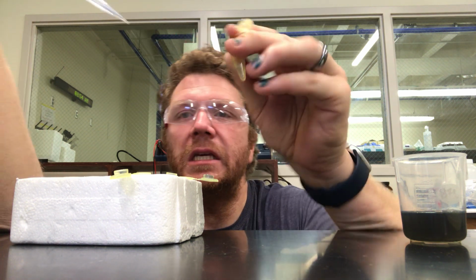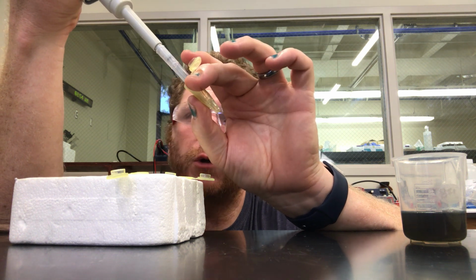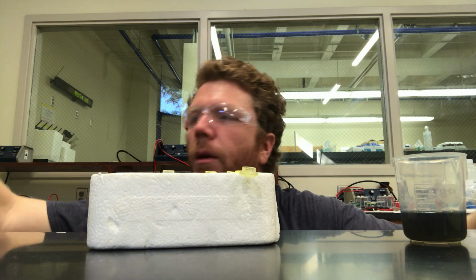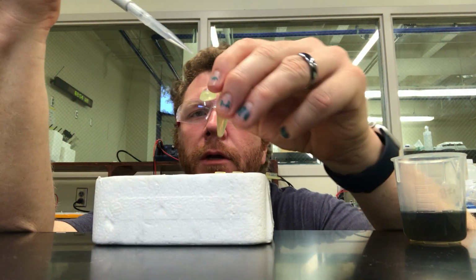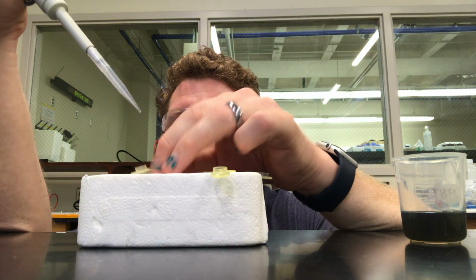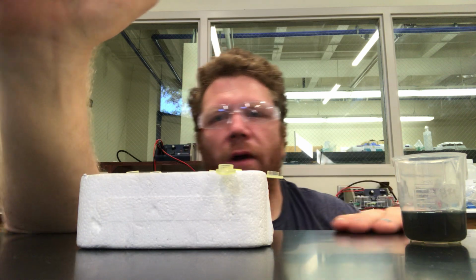Now one thing that you're not really seeing is every single time that I do this, I'm getting a new pipette tip. You always want to use a new pipette tip when you're making these dilutions. Okay, so I'm going to now take 100 microliters out of microcentrifuge tube number 3, put that 100 microliters into tube number 4, get a new pipette tip, get 100 microliters of water, add it to there. Okay, so now the last pipette transfer is 100 microliters from microcentrifuge tube number 4 into tube number 5.